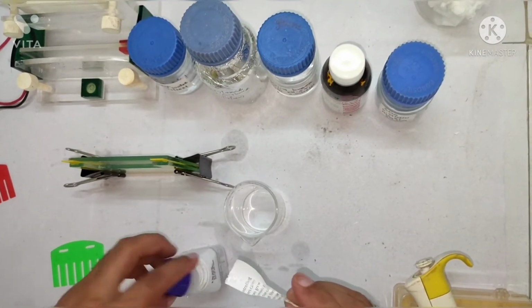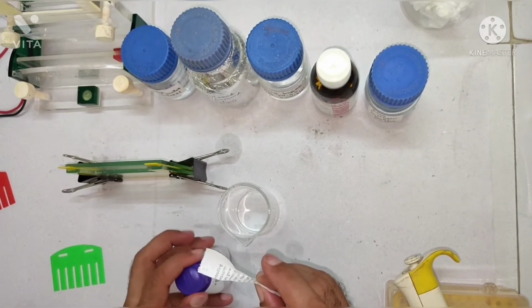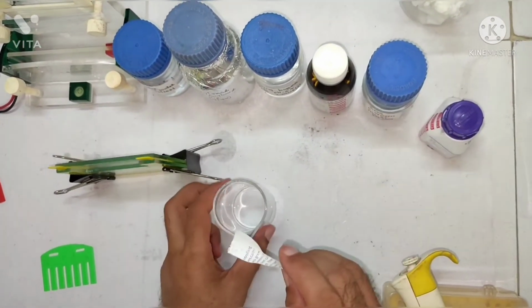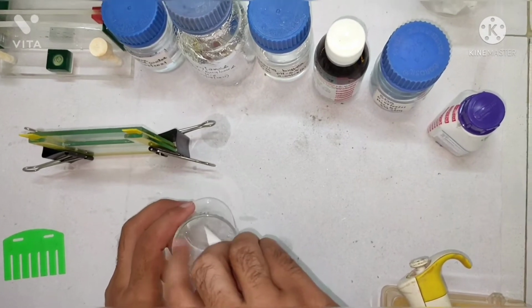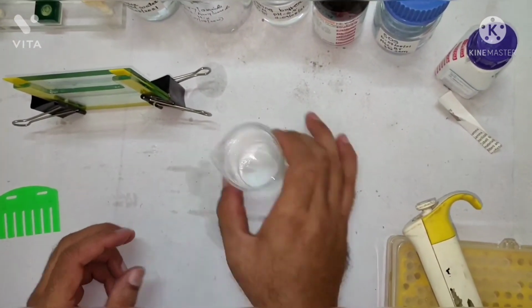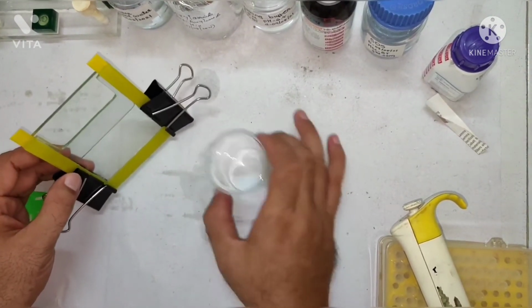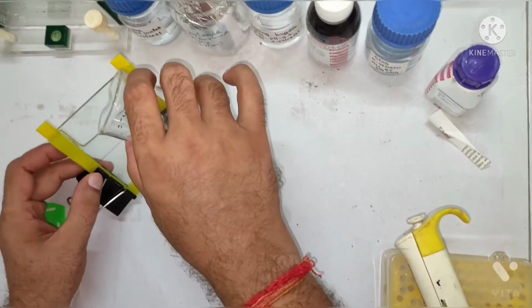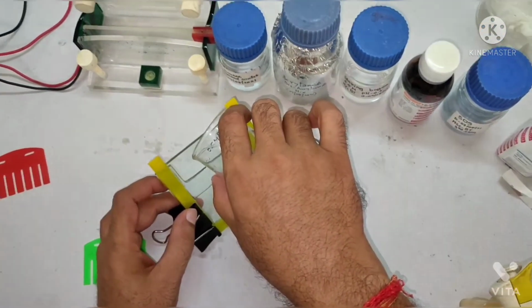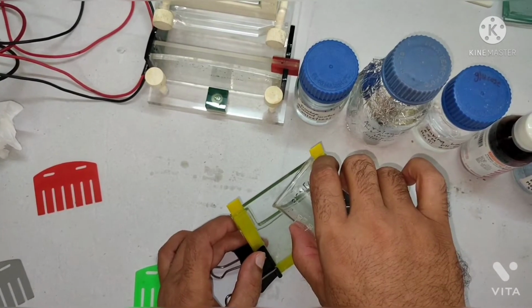Just cap it first, otherwise it will get oxidized. Then mix it properly and do the things very quickly, otherwise it will polymerize in the beaker itself. So we mixed it. Now you pour. You can pour with the pipette also, if you do not have a trained hand.